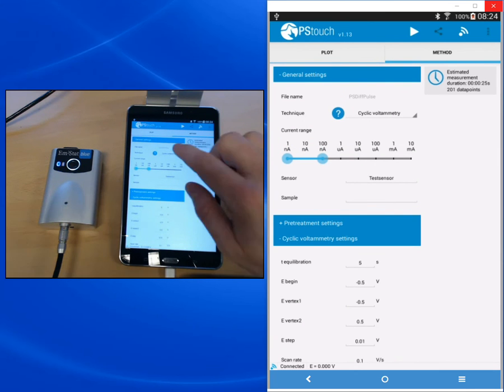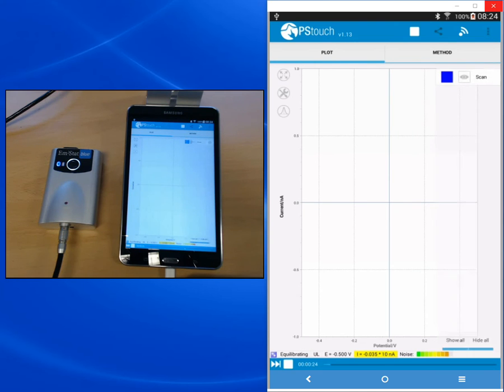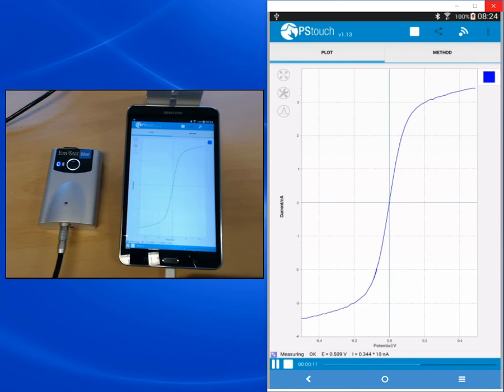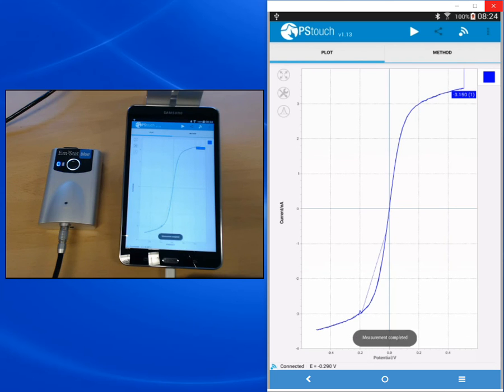Now we have set our parameters. We start the measurement by pressing the run button, which is the right-pointing triangle at the top. The measurement starts and at the bottom of the screen we see a timeline showing how long the measurement will take and how far we have progressed. We also see the curve being built up. Next to the timeline you have buttons to pause or stop the measurement. After the measurement is completed, the software tries to find the peaks, which is of course rather difficult for an S-shaped CV.